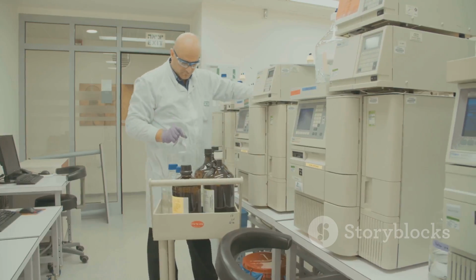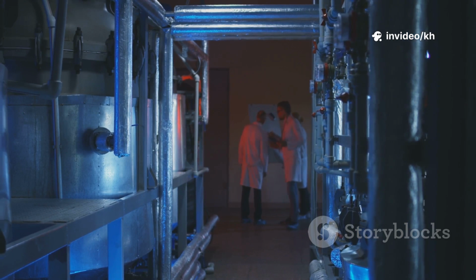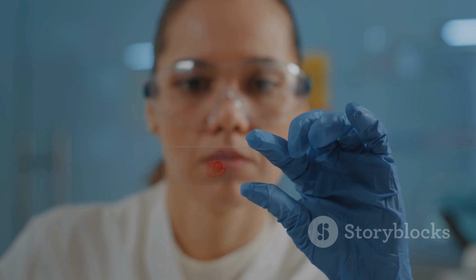Mass spectrometry is another game changer. Here we blast samples with energy to break them into ions, then measure their mass. This tells us exactly what elements and even isotopes are present. Techniques such as MALDI-TOF and SIMS are especially useful for polymers, biomolecules, and even tiny contaminants.